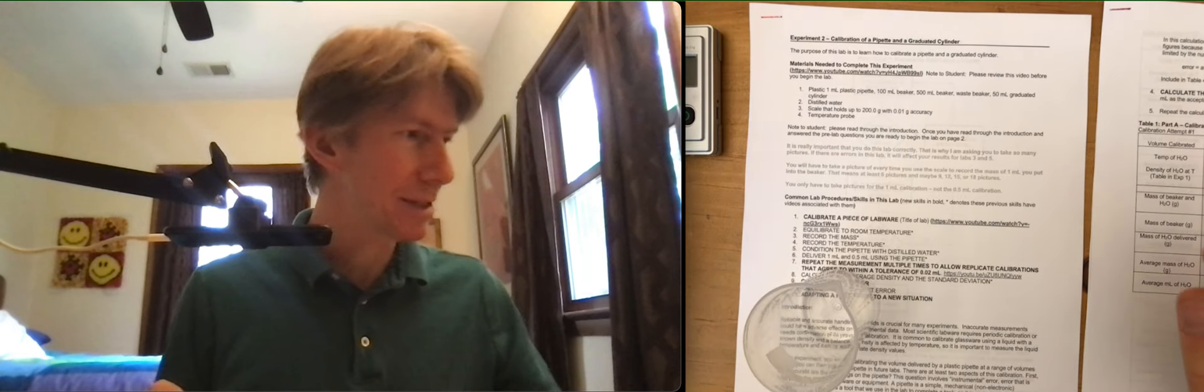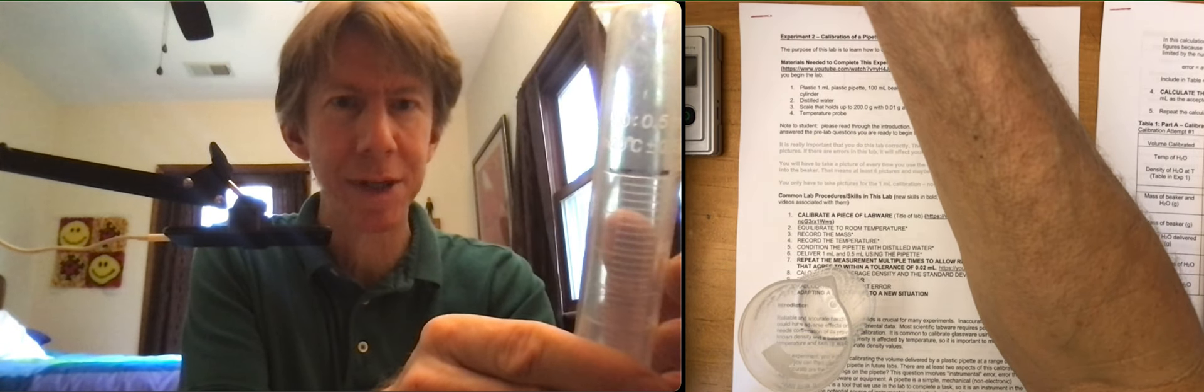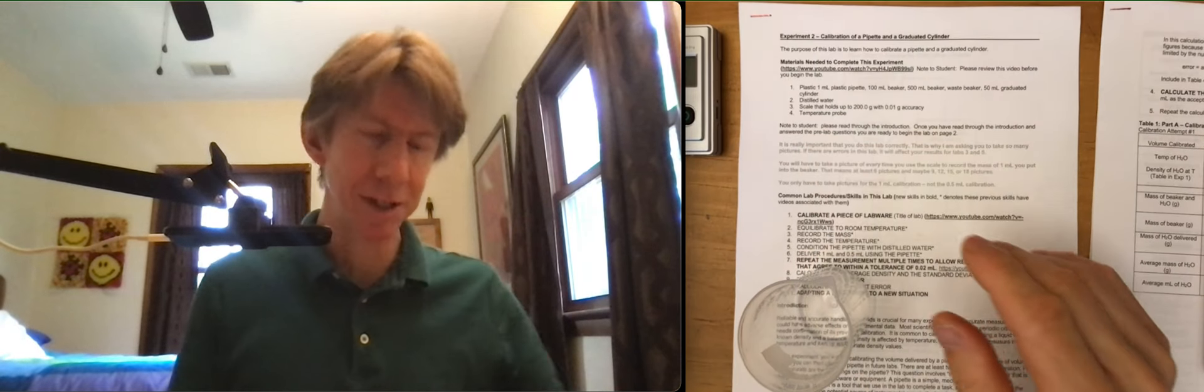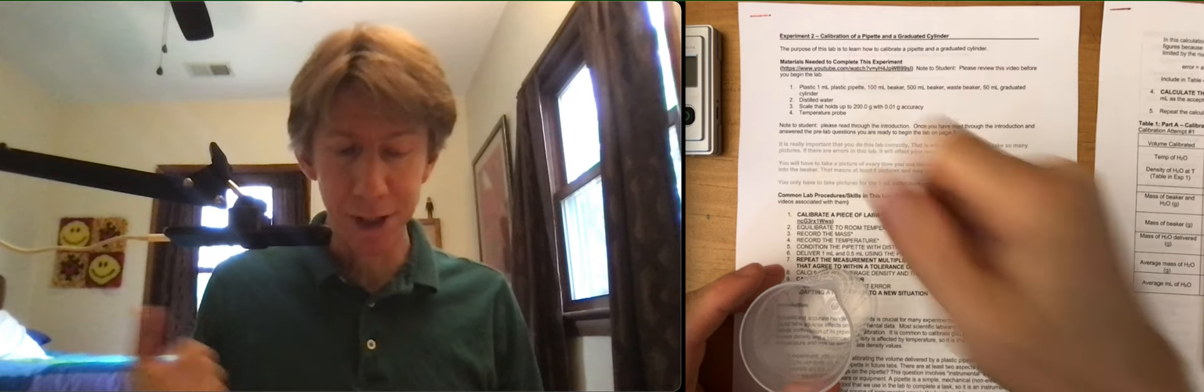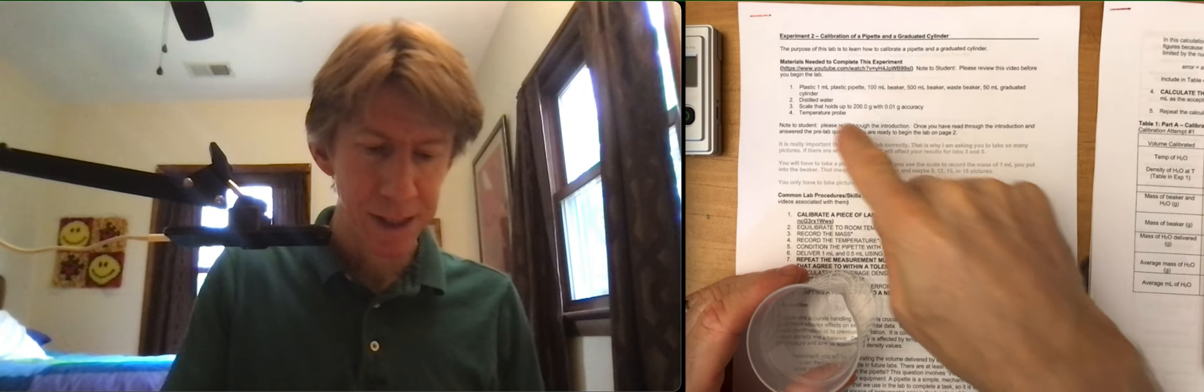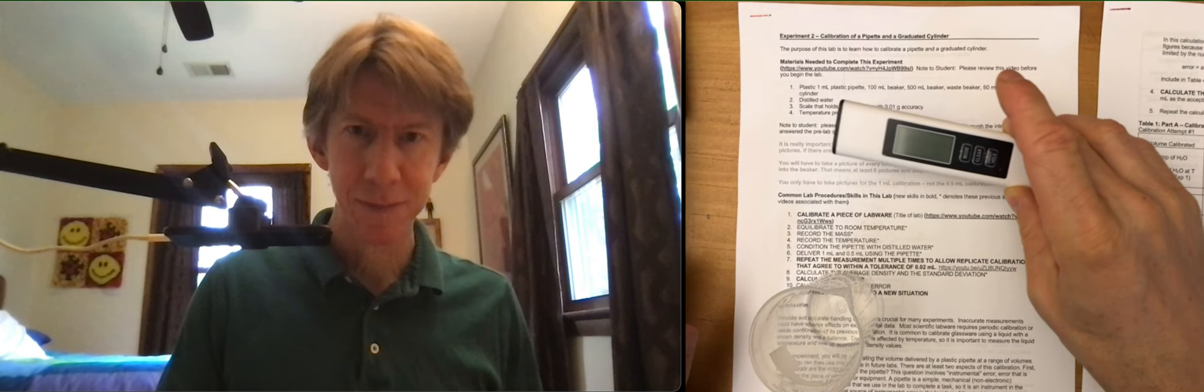A 50 milliliter graduated cylinder, and I've done this lab before so that's where my line is for the calibration of the 50 milliliter graduated cylinder. Distilled water, I used tap water. A scale that holds up to 200 grams, same scale as last time, and a temperature probe. So we've got all the pieces.